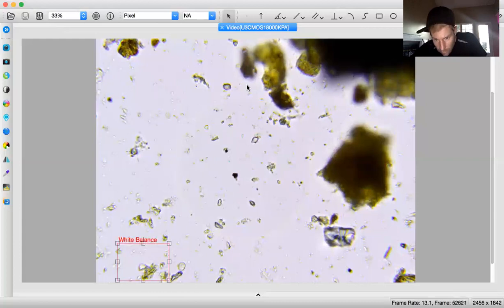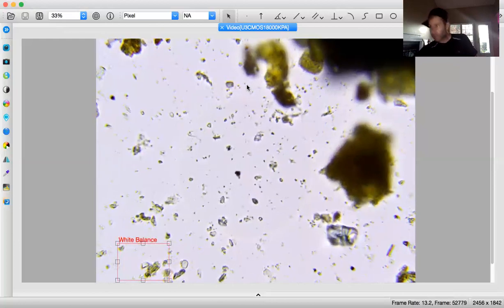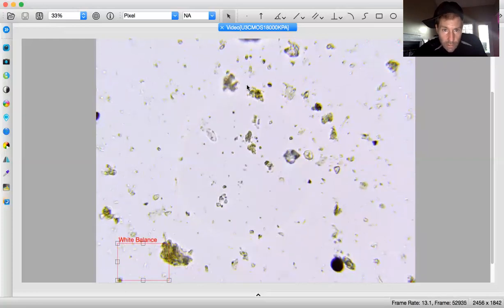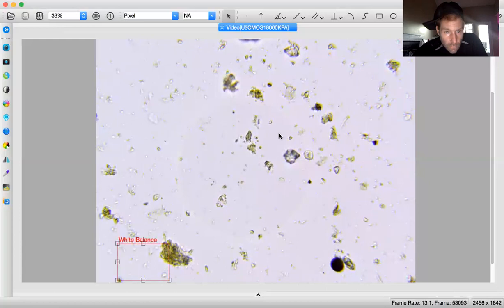All right. So here's our last frame. Very exciting. Flagellate all day long. Look at him go. That's one flagellate. Thought I saw another. Yep, I did, right here. Gotta be quick about these things. That's 2 flagellates. I don't see any more, so I'm gonna record 2.